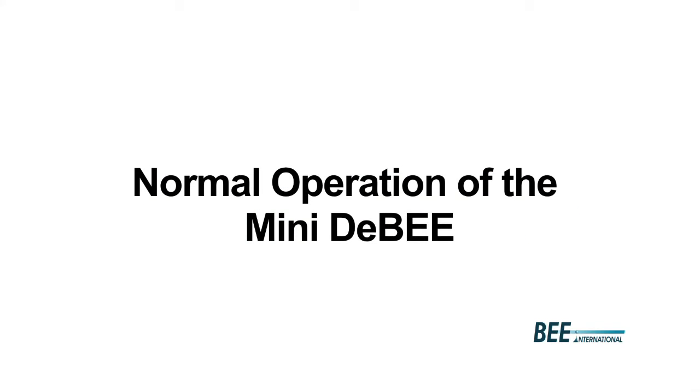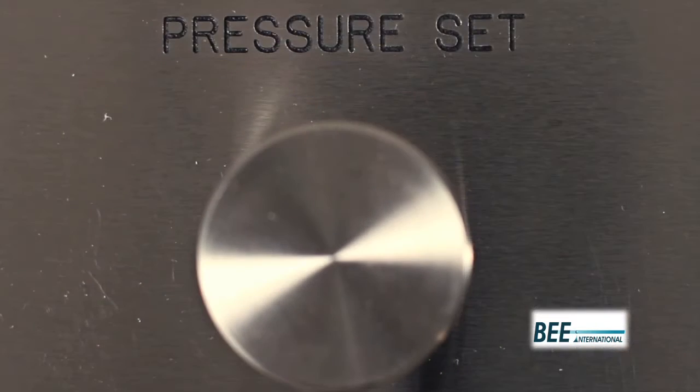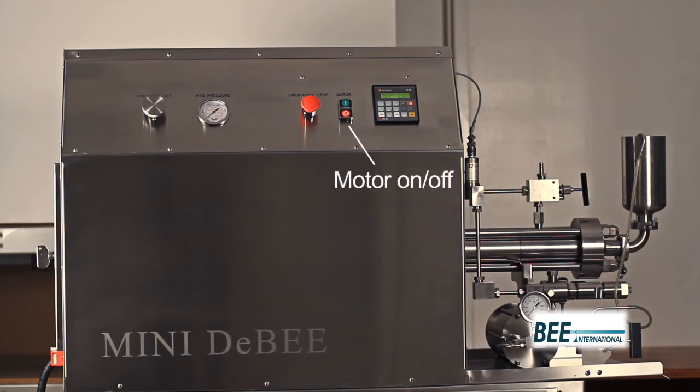Let's take a look at the Mini2B components. On the control panel, we have the pressure set dial to control the process pressure, the hydraulic pressure gauge, the emergency stop button, and the motor on and off button.